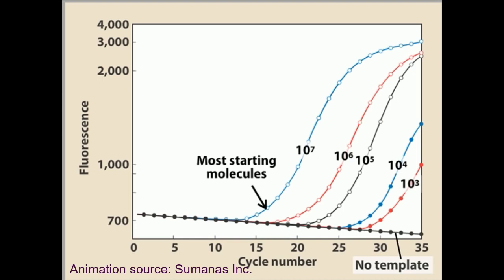Real-time PCR is a quantitative assay, providing the ability to compare experimental samples with known reference samples. In contrast, in standard PCR technique, the reactions are analyzed at the end of the cycles, when the reactions are no longer running efficiently due to limiting reagents, and are therefore not quantitative.